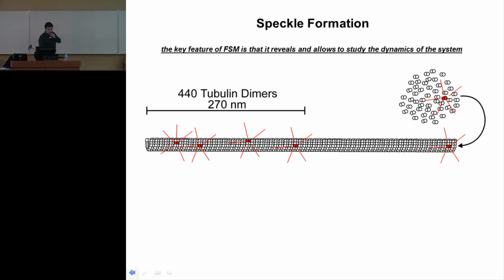So what are those speckles? The speckles are sub-resolution clusters of fluorophores. In these images we have high resolution microscopy with a numerical aperture of 1.45, which means that the limit of detection of two adjacent spots is about 250 nanometers. Within this distance, when we have between 4 to 7 labeled subunits, we can see a signal above the noise floor.